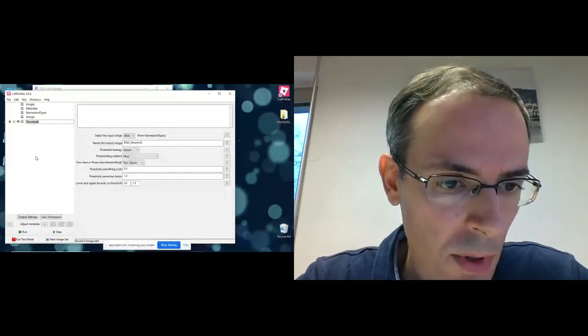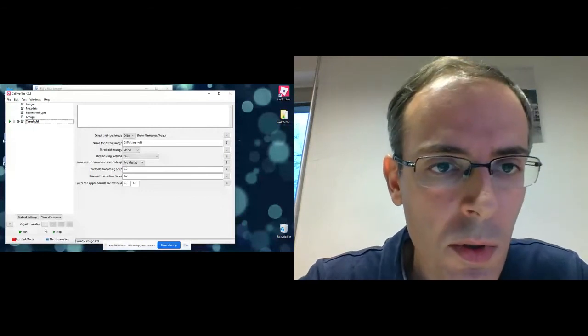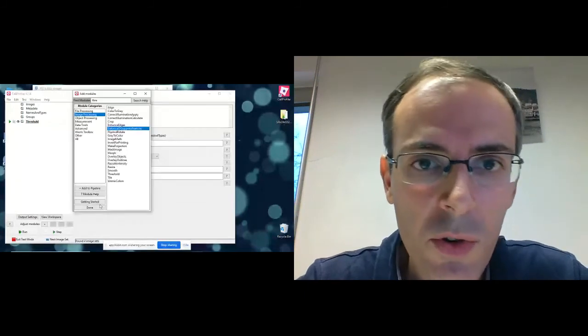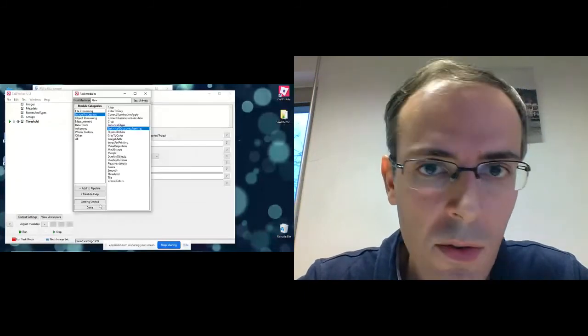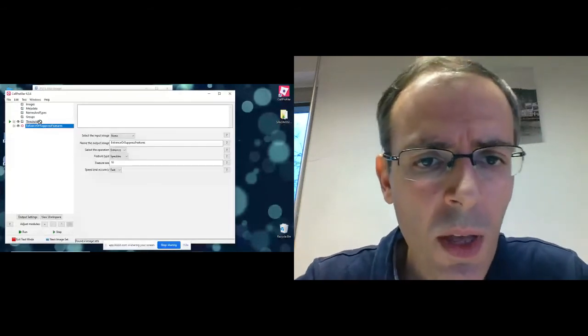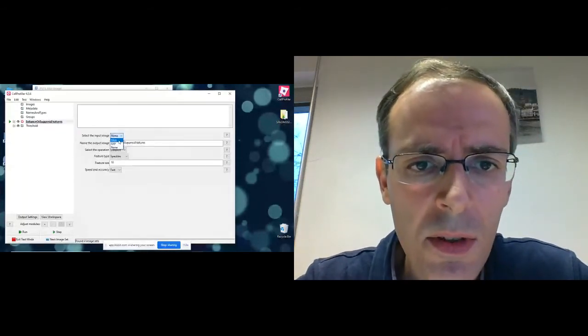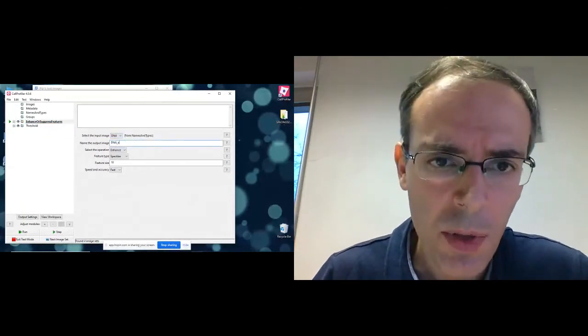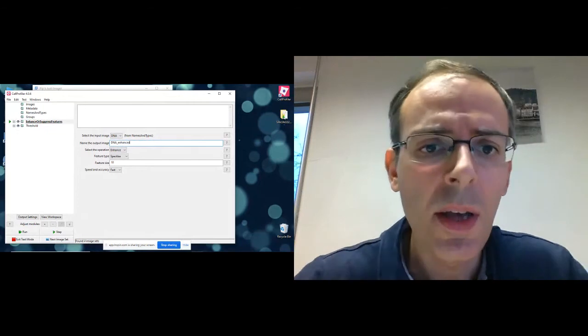So let me add, we want to do image processing, and one of the modules is called enhance or suppress features. Let's add this. Let's add it before the threshold. Let's enhance the DNA image. Let's call this enhanced image DNA enhanced.